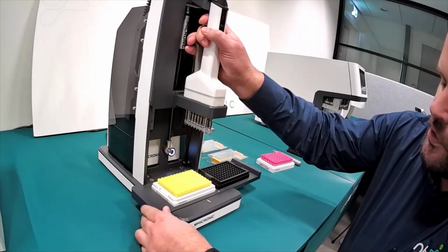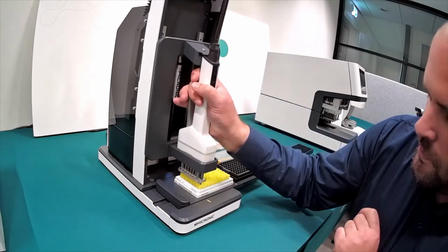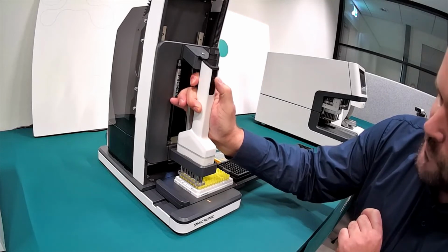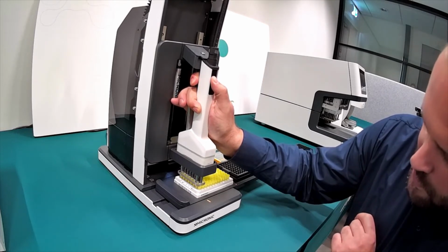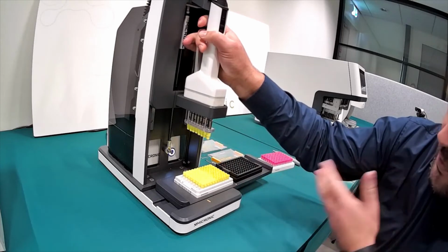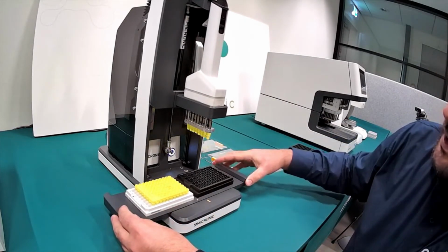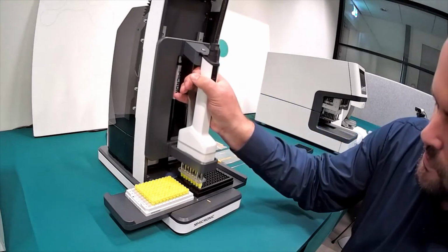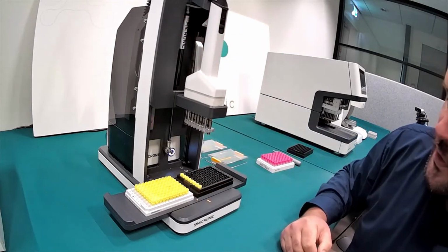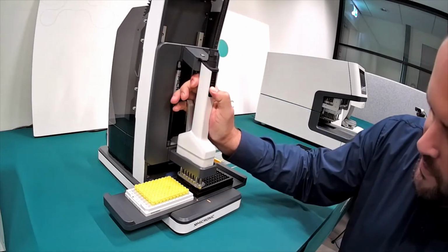So first you go to, for example, row 1 of your 96 plate. You push down the machine. On top here are 2 buttons, unscrew and screw. So this time we unscrew. When we do, we lift it off, and you see all 8 of the caps are attached to the cap carrier, the capper, and then we go back to the cap carrier and unload them. And over here you have your tubes decapped. Of course, it is very easy to attach them back.